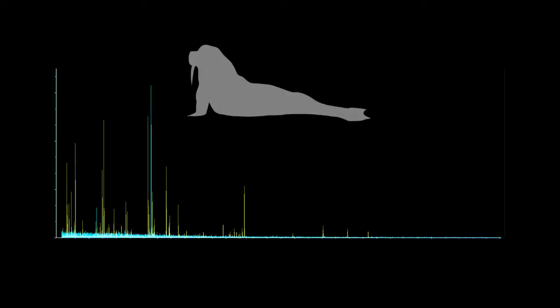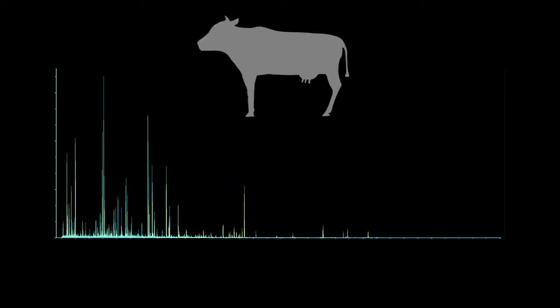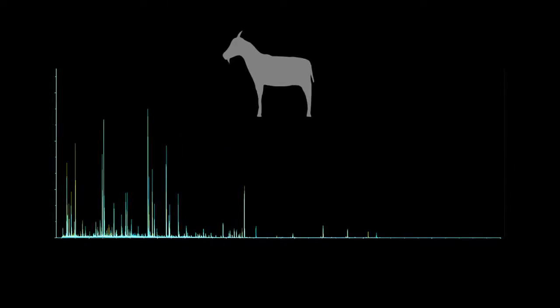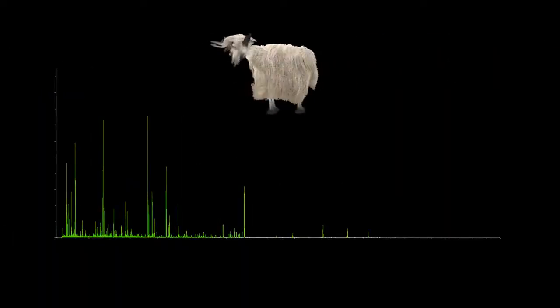Each sample provides a unique fingerprint, and by comparing results to an expanding database, it's possible to make a secure ID of the species origin of the sample. The more this database grows, so too will the ability to identify the type of animal used to make the parchment.